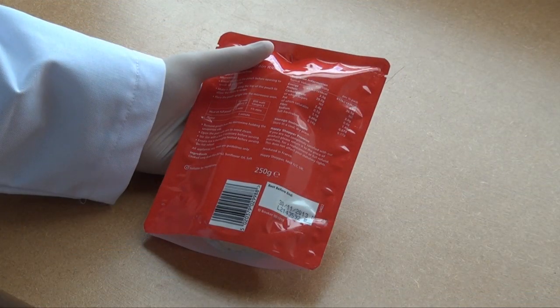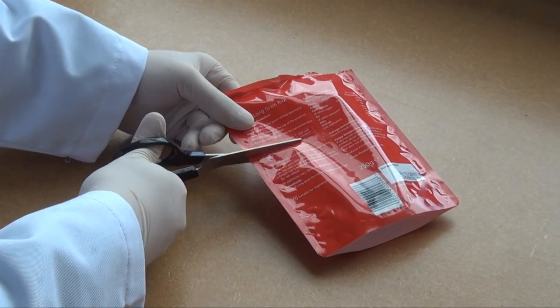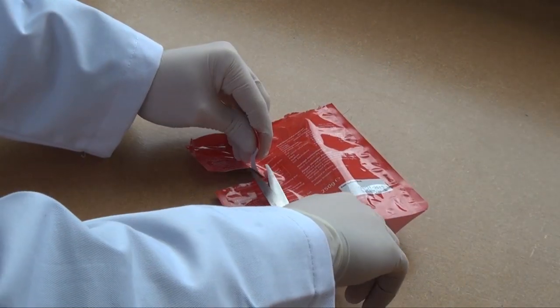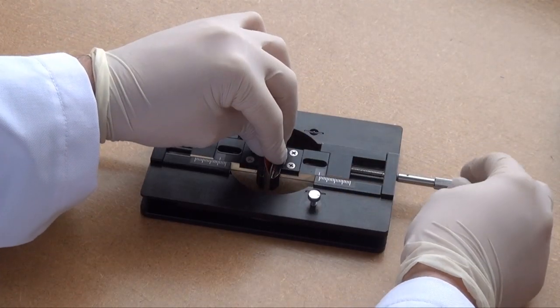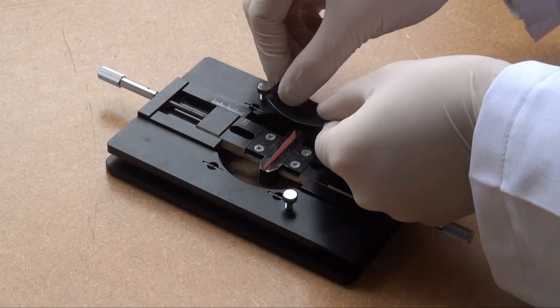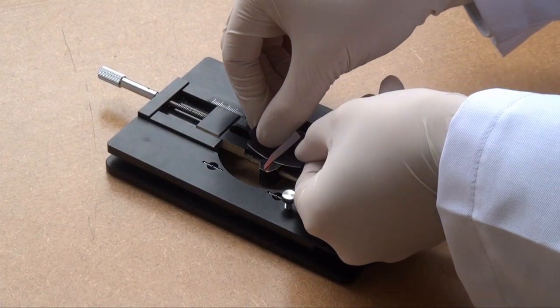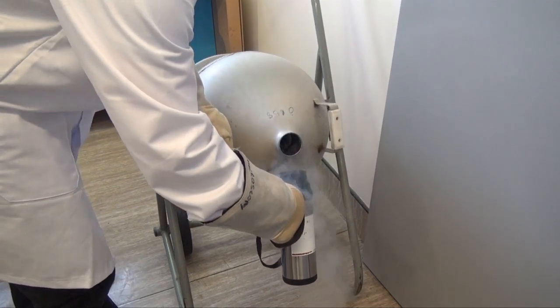When pouches leak or lidding film fails to seal properly to a food tray, it's important to identify which layer of the material has failed. FTIR microscopy can identify each of the plastic layers in order to trace the source of the problem.